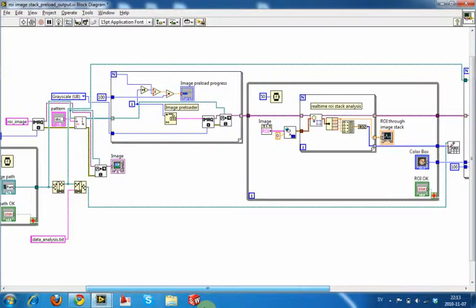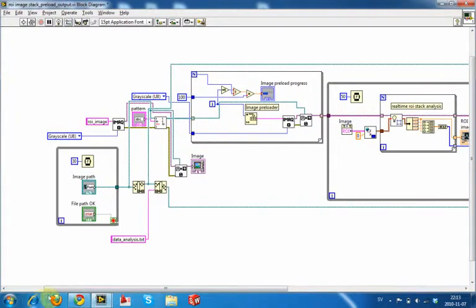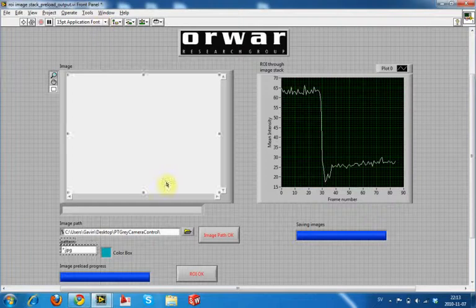Okay, but what we're aiming to achieve, we might not have this preload configuration. We might just have the run-through configuration. However, what we're going to achieve is we're going to pick a file which belongs to a certain folder type. We're then going to choose a pattern of the files of interest. So first it's just .jpeg, but we might have a channel specifier as well if it was a confocal image. Going to choose a color for what color we want to make our new images, and then we're going to capture all of the ROI data for those files.